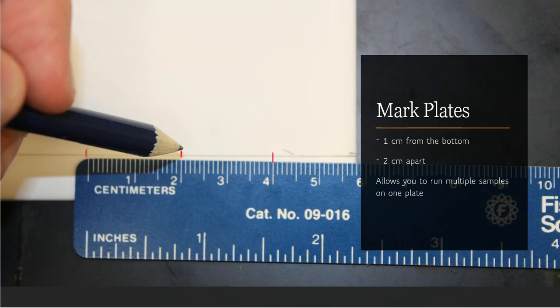At 4, I'll make another one. At 6, of course, it looks like I'm off the edge of the plate, and I'm not going to make one there at all. So when I do that for all 3, right? We've got 3 separate plates. I need to do it for all 3. This is what I end up with. There's my tick marks.